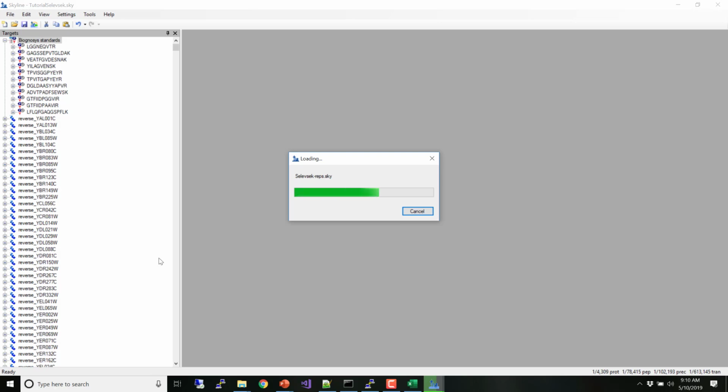And it is. I see CVs reported against 3 things. But if you have 8, they collected 8 reps. So I'm going to use all 8 reps and just know that if people are reporting CVs on very small numbers of things, that's going to systematically underreport the true variance.